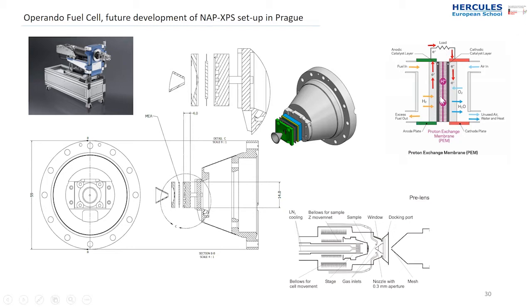So you have different electrodes here, anode and cathode, and studying what is actually happening on the cathode side is very crucial for the reaction. So we are building a machine that brings the hydrogen, feeds it through the stage, to the fuel cell setup built inside on this side, and from the other side, which is actually the inner part of the high pressure cell, will be filled with oxygen.